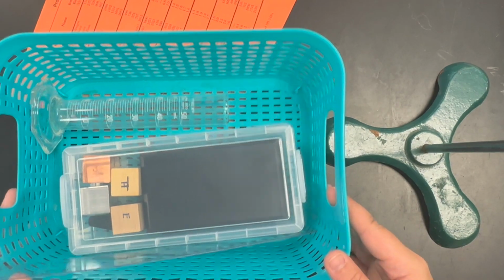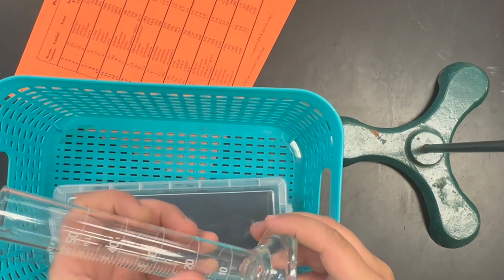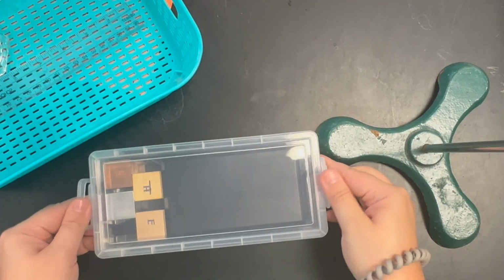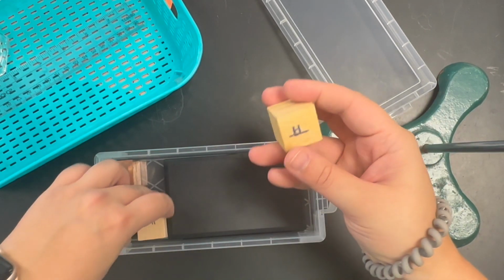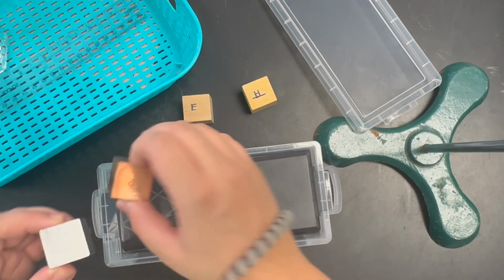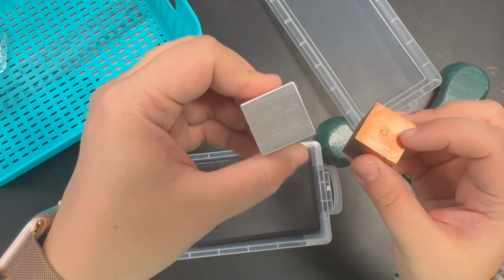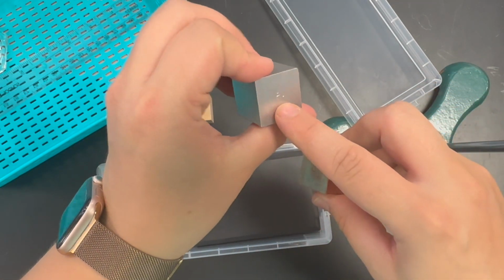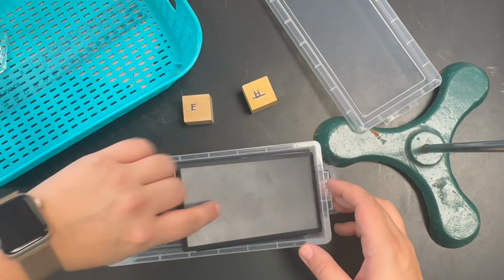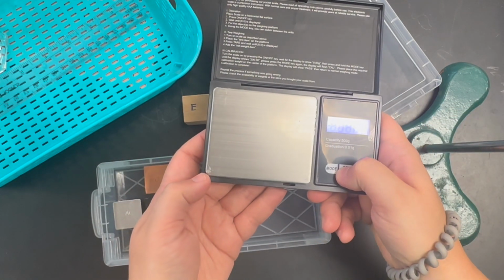Okay, so at your station, you're going to have this blue bin with a ruler, a 50 milliliter graduated cylinder, a second smaller bin with 2 wood blocks, one labeled H, one labeled E, and 2 metal cubes. This one is copper, it has the Cu to denote that. And the silver one is aluminum, and there's the Al for that one. You'll have a rubber stopper, and you'll have your scale. You just pop this open and turn it on.